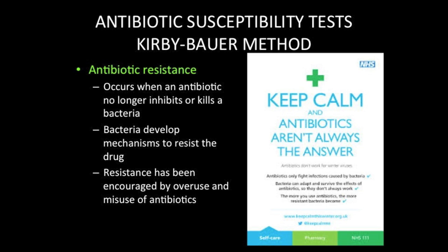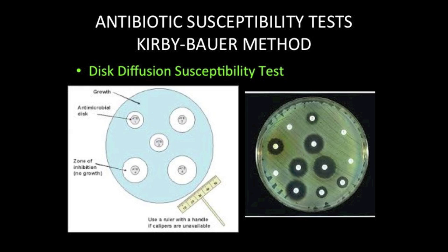Bacteria may develop resistance to antibiotics via several mechanisms. We will explore some of the mechanisms of antibiotic resistance in Unit 4 of the lecture portion of this course. It is more important at this time that you understand that the development of resistance has made the selection of an antibiotic to effectively treat an infection more difficult. The development of resistant strains led scientists in the medical community to develop a means of testing susceptibility of bacteria to antibiotics to aid in the identification of an effective drug as early as the 1950s.